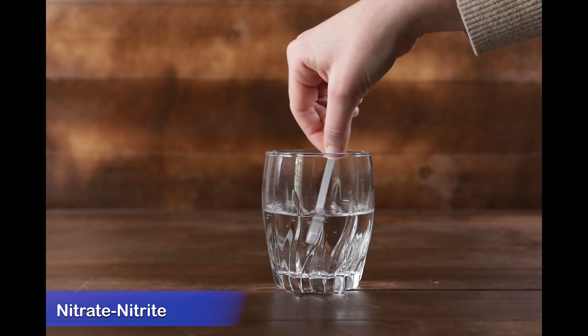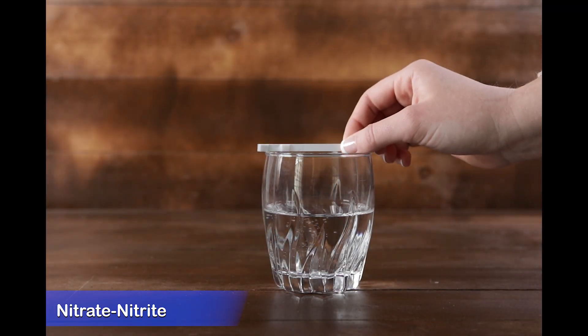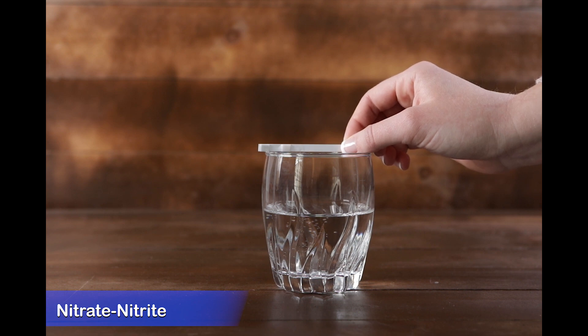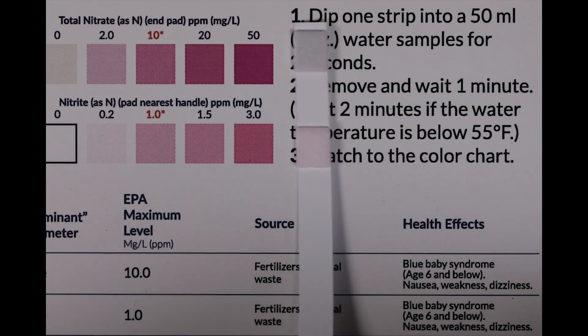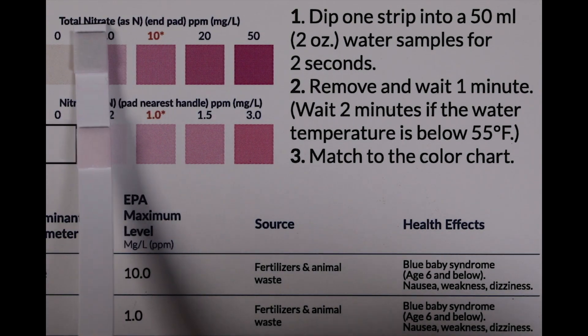Dip the nitrate-nitrite strip into two ounces of water for two seconds. Remove and wait one minute for the color to develop. Compare the strip to the color chart. The closest match indicates the level.